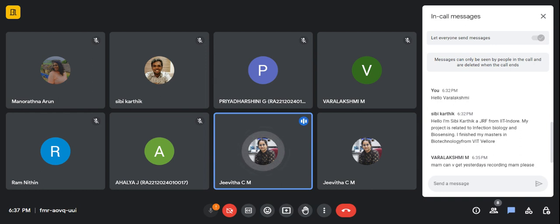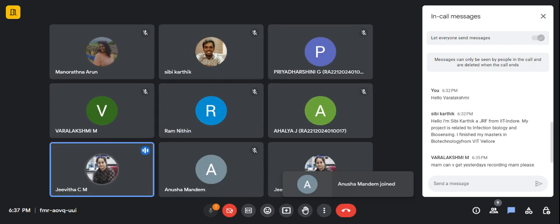Whatever experiment you do, whatever advanced technology you use, at the end you come to the BLAST page to verify whether the gene or result you got is correct or not. So the basic thing is handling the NCBI data and BLAST results. We'll be focusing on that, and also on one more session.